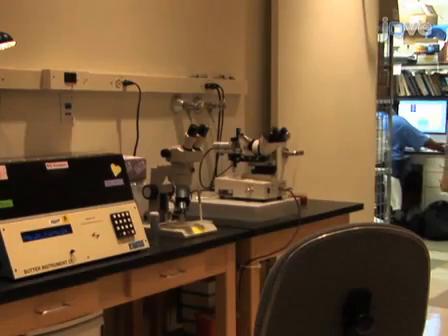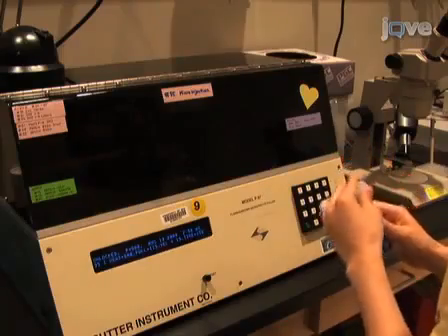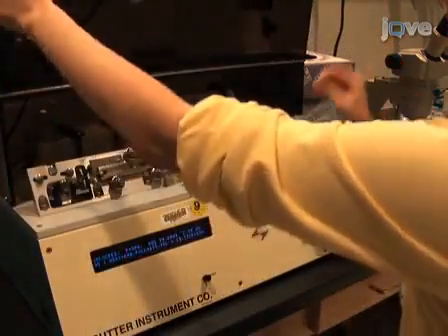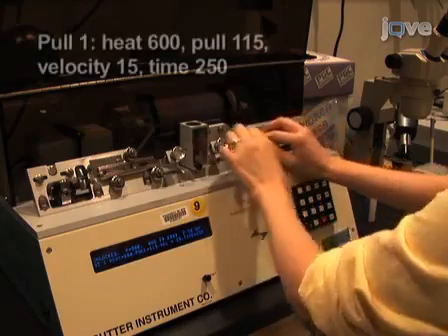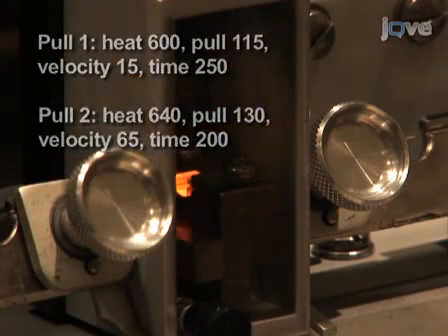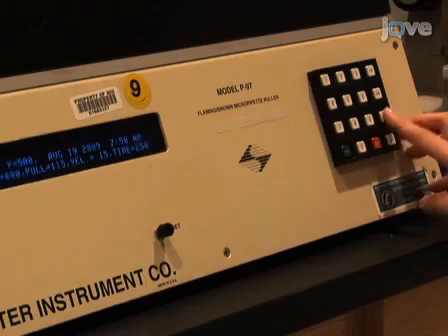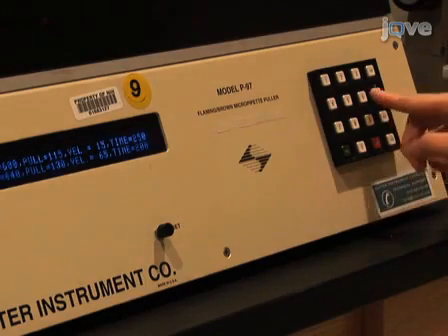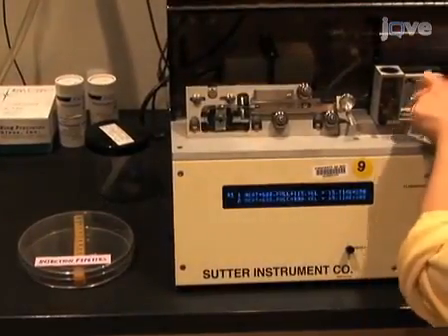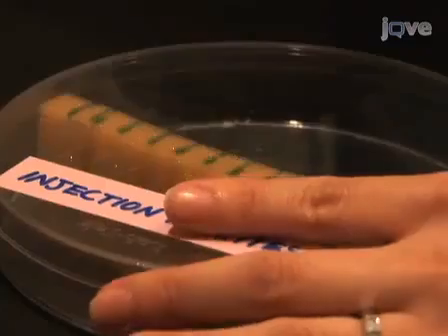While the neurons are incubating, microinjection pipettes are prepared using a Sutter P97 flaming brown puller and thin-walled borosilicate glass capillary tubes. We use a two-stage pull program with the following settings for pull 1 and for pull 2. Since the settings required vary with different batches of glass and by the condition of the heating filament in the puller, they should be adjusted as needed. At least 5 injection pipettes should be pulled per dish of neurons in case the pipettes become damaged or there are problems during the injection session.